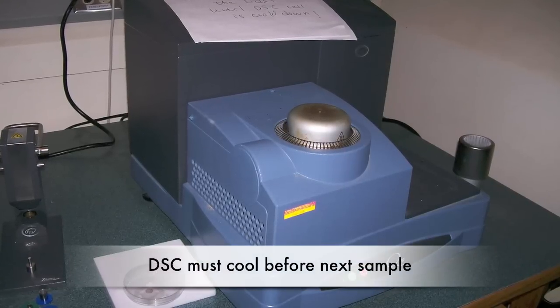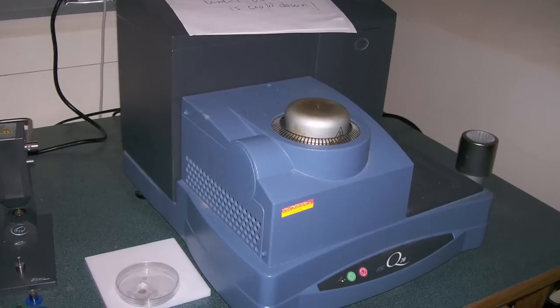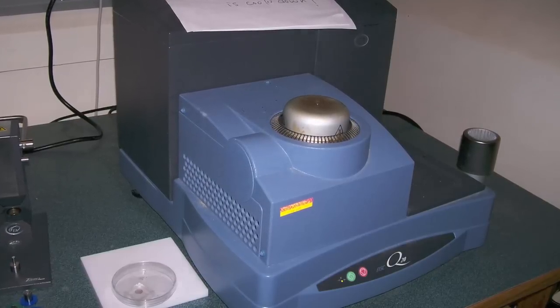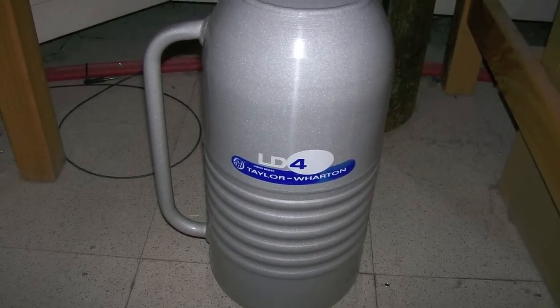To run another sample, the DSC must cool down. Since this DSC can only control the heating process, the instrument only cools very slowly. Liquid nitrogen can be added to accelerate this process or to cool the DSC for subroom temperature experiments.